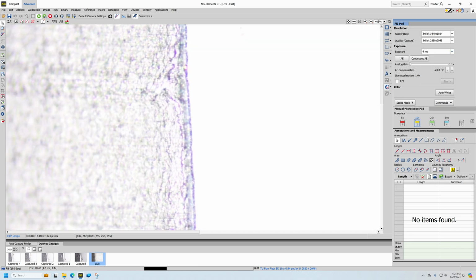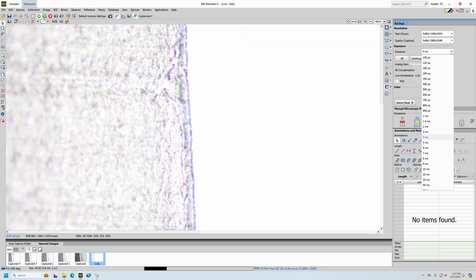This is a tutorial video on how to capture HDR, high dynamic range, or reflection-free images. This is useful in situations where parts of the sample that are in the same field of view are either oversaturated or underlit. And so where there's a fight, so to speak, to properly illuminate various parts of the same sample, you can utilize the high dynamic range tool or the capture reflection free image tool to get an image with everything optimally in focus.